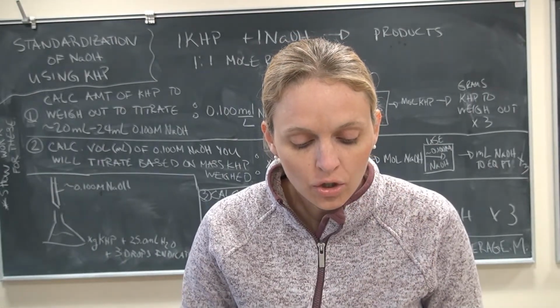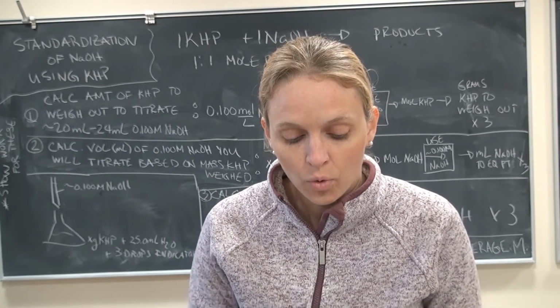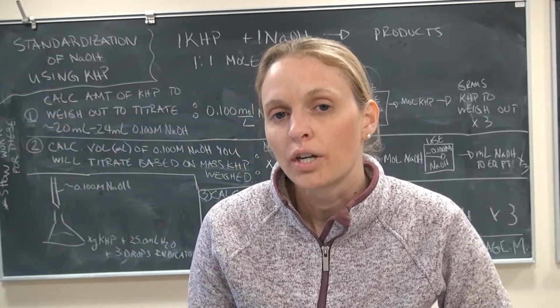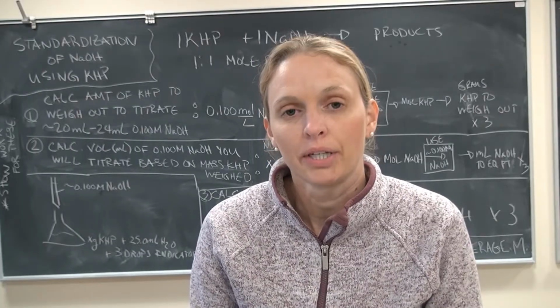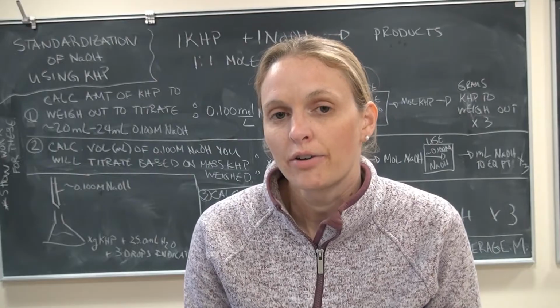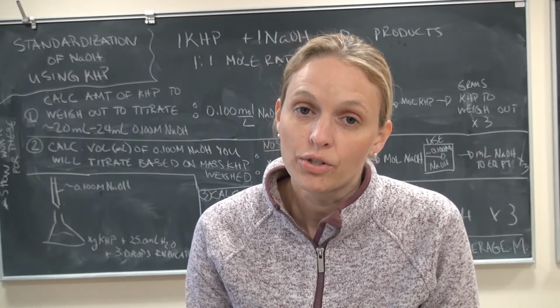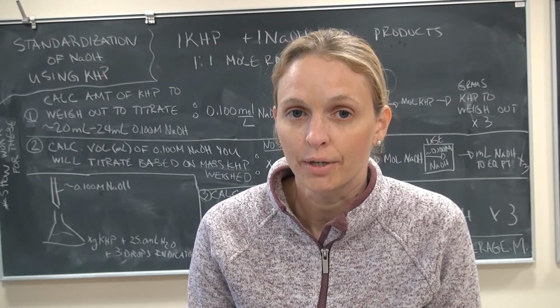And in your lab notebook, in the lab skills section for learning titrations, it goes into a pretty detailed explanation of that standardization process. So if you need a little bit more understanding and reading on that area, then please refer to that section. That would be good to read before you watch this video.